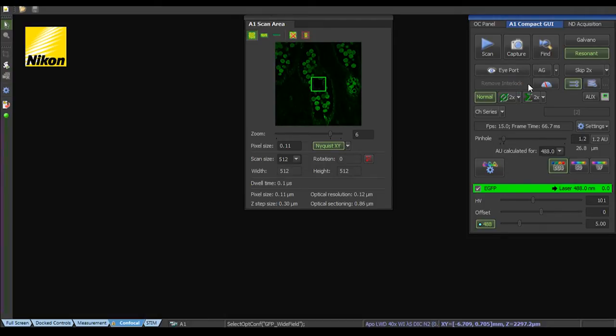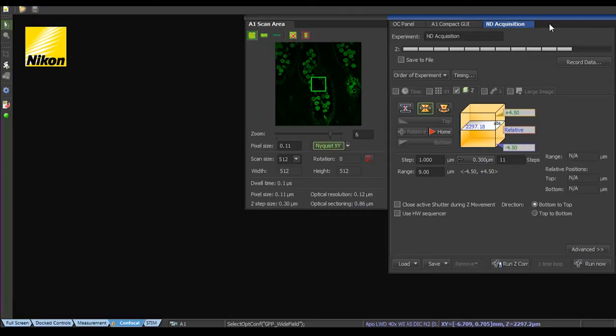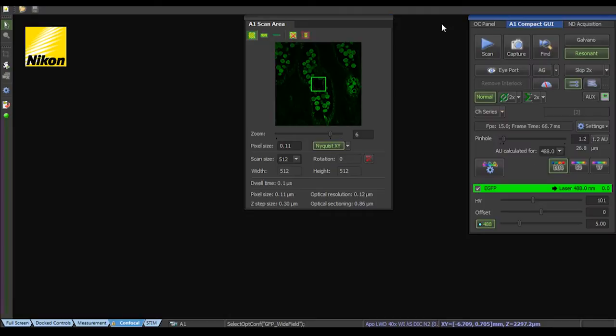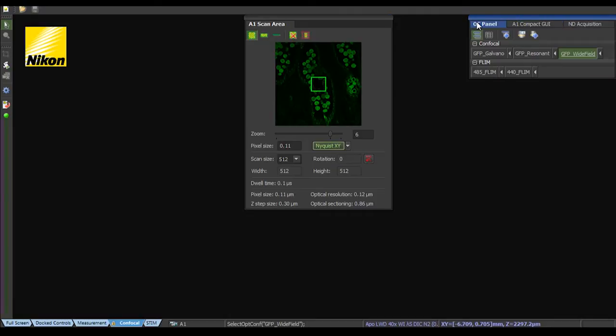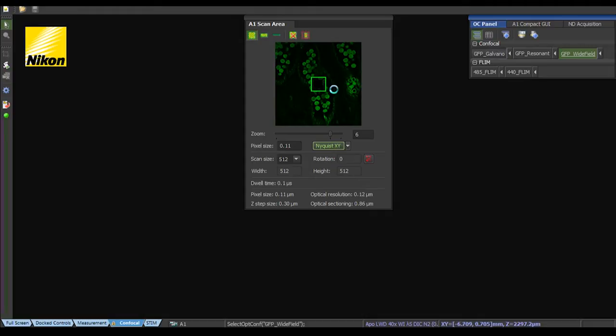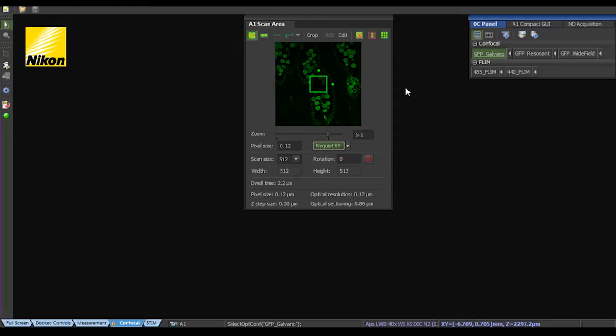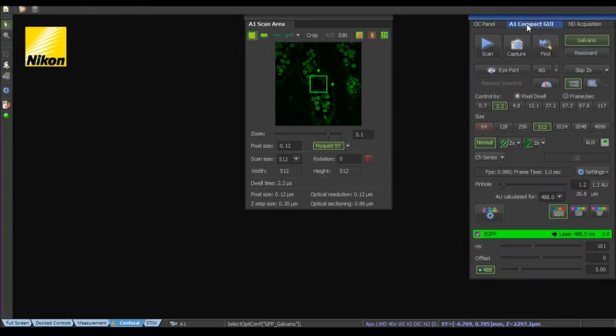So once the interlock is released, as we see here we've got different configurations. I can just pick the configuration for confocal imaging and when it's activated, I can just click scan.